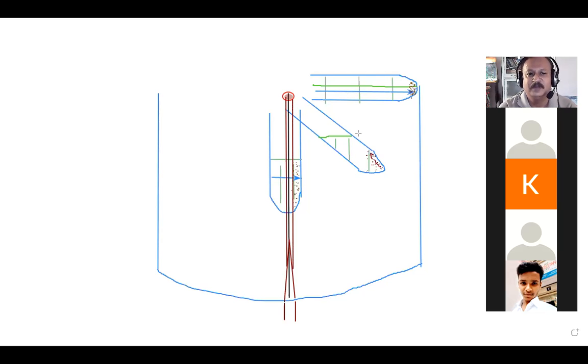Just imagine the situation where the tubes are kept in a horizontal position. We can easily imagine that the distance traveled by the sample components is the maximum, and therefore, ideally, we should get very good separation here. Not only that, but all the sample components are going to the bottom of the tube. That also makes it very easy for us to separate the supernatant from the pellet, isn't it? Because the pellet is going to stick to the bottom, and therefore the liquid part, the supernatant, can be easily decanted from that tube. Is it right?